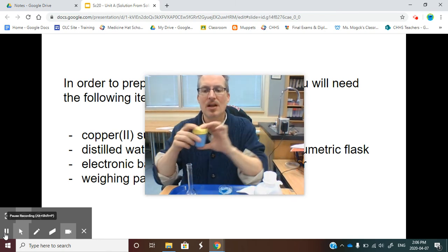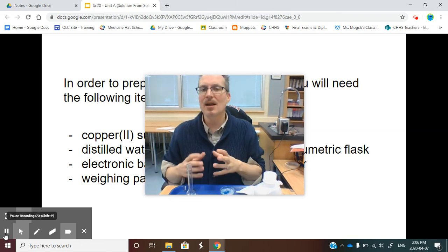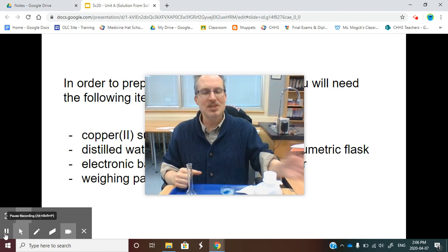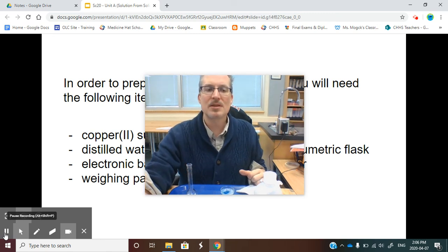Now that I have the solids, if I want to make a 0.5 mole per liter solution, I can. If I want to make a 3 mole per liter solution, I can. I just have to do the calculations in order to do that. Hope you enjoyed the video. Thank you very much.